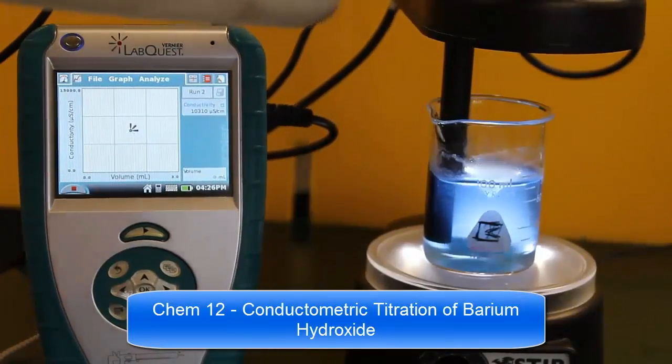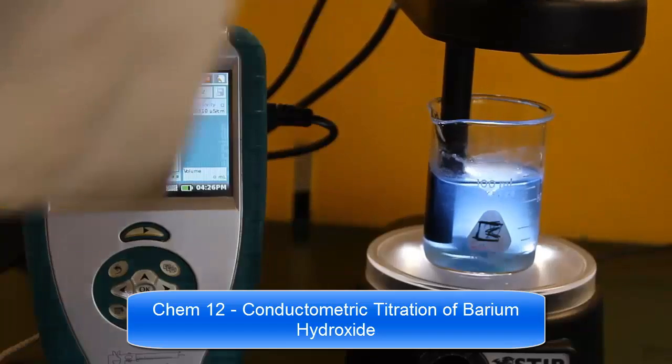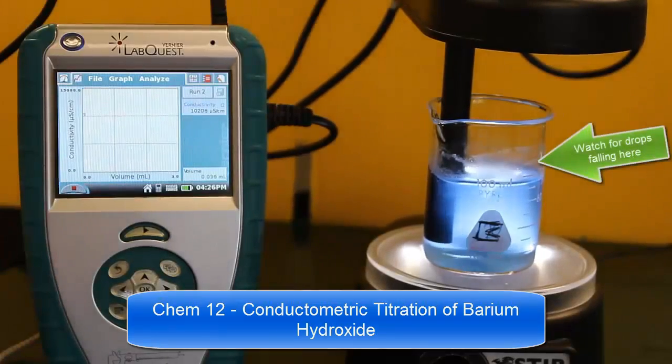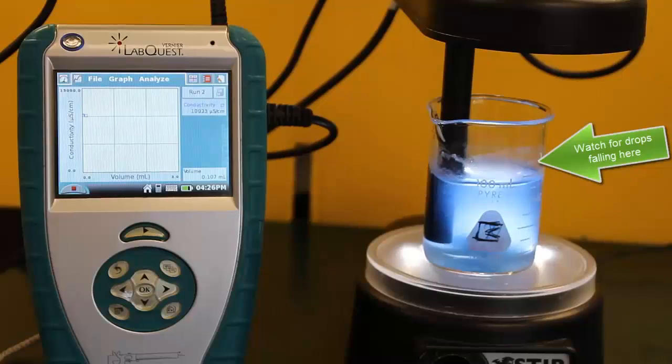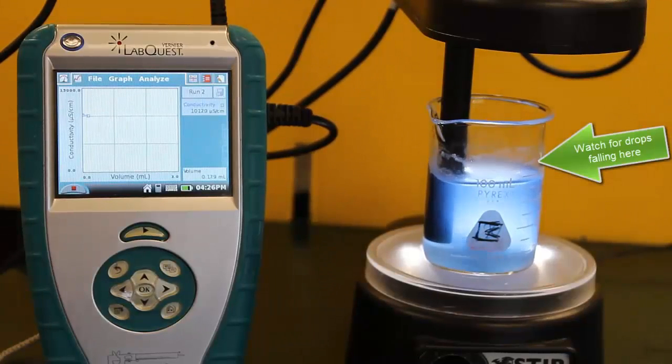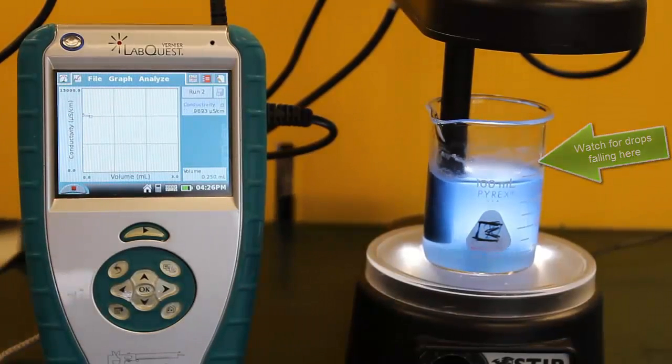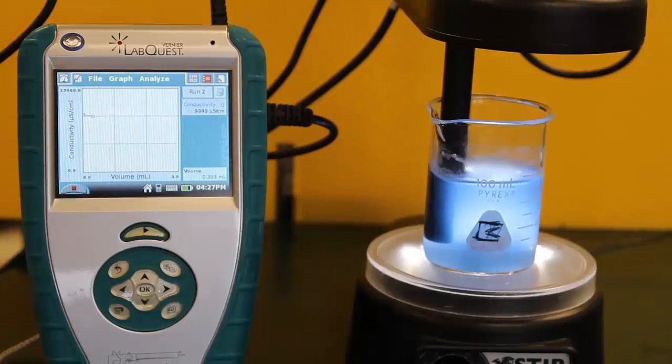Welcome everyone, here we have the conductometric titration of barium hydroxide. Watch for the falling drops of sulfuric acid on the right-hand side as they drop into the blue solution of barium hydroxide.